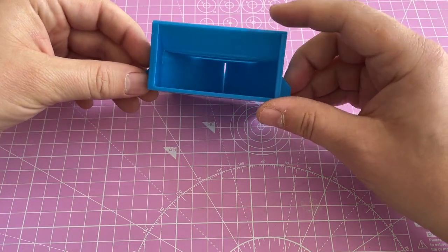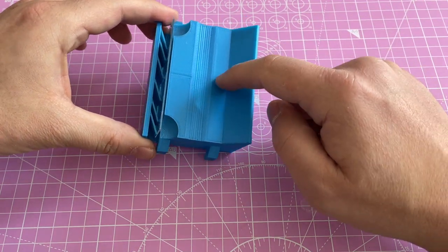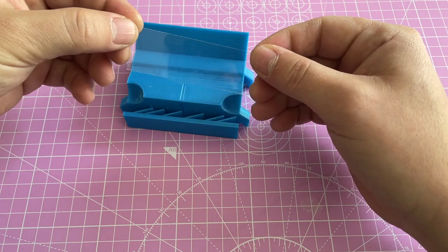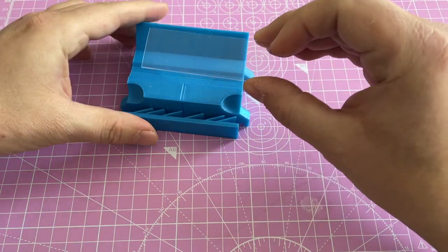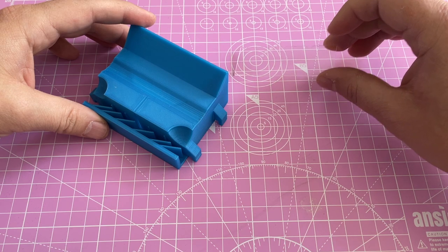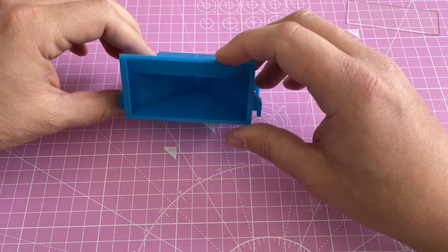So, this is a small attachment for your bike. It will collect air, it will accelerate some particles, and it will stick them to this glass slide. Then the glass slide you put directly on your microscope and you are ready to go. So, how does this work?